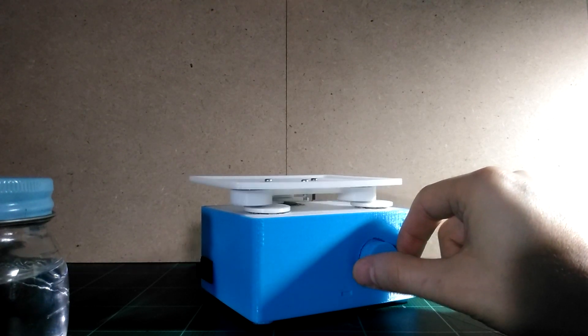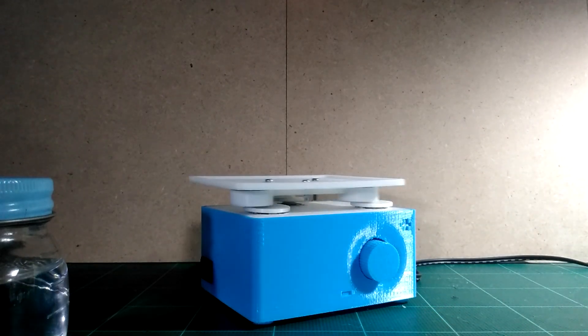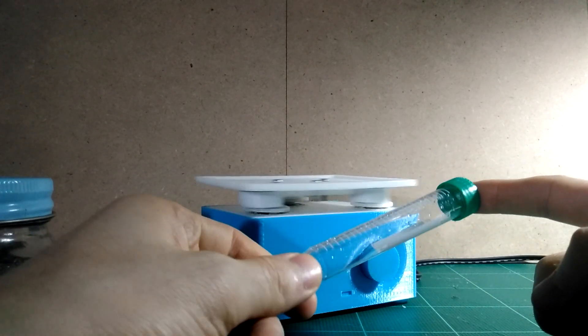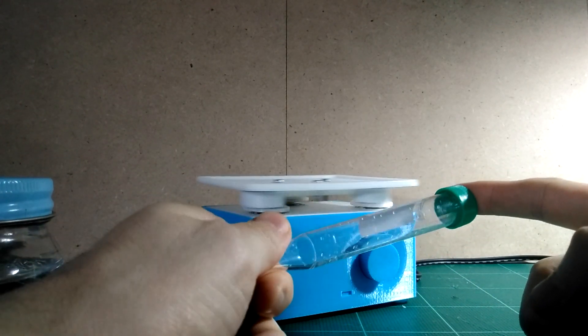Even with a customized holder for something as heavy as a jar, I'm not sure if it would work well or not. We've already tried using test tubes on there and it shakes them up pretty good. The machine doesn't seem to be under any stress.